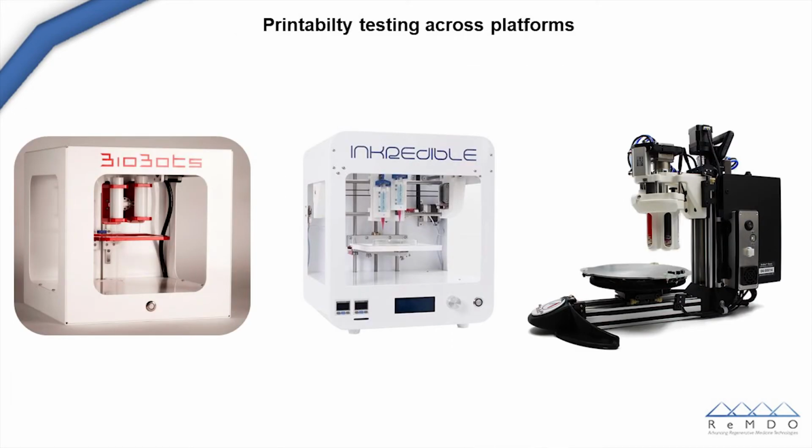This slide illustrates that we have access to multiple different bioprinting systems, and we're in the process of testing the Bioink systems in each one of these bioprinters to ensure that there is cross-compatibility. That's one of the milestones: we want a system that is essentially out of the box, and we can provide custom protocols for each one of these systems using our Bioink system.